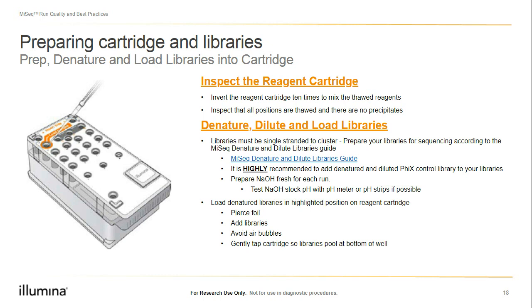We also advise starting the run within 1 hour of denaturing the libraries, after which you can perform an additional heat denature if we don't want to re-prepare the libraries. Instructions for that heat denature can be found in the Denature and Dilute Libraries Guide.